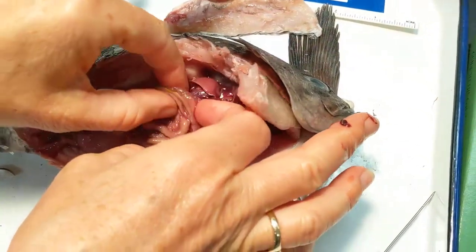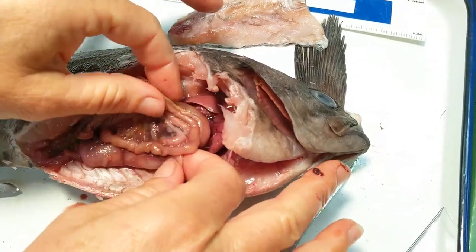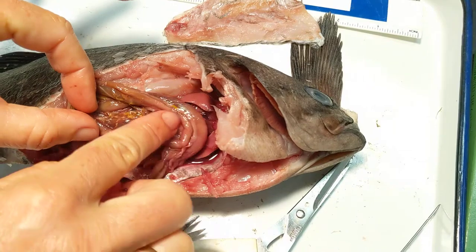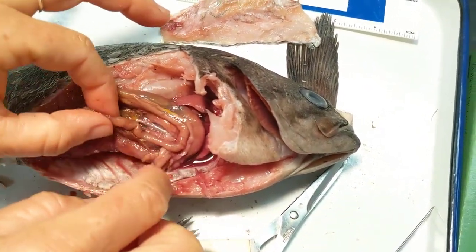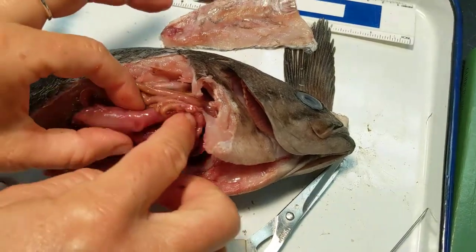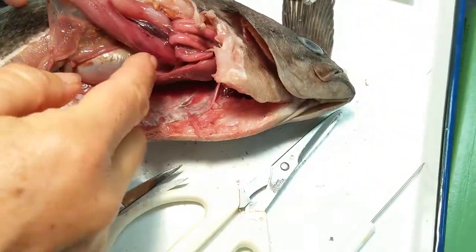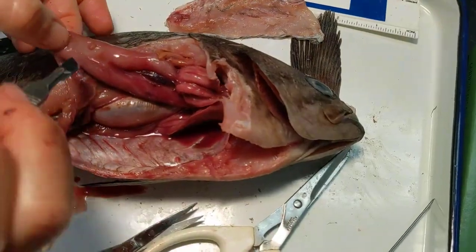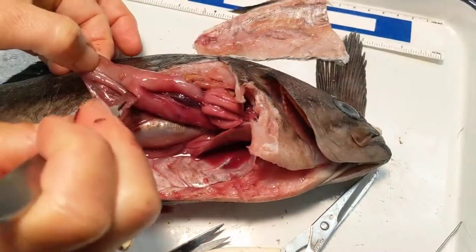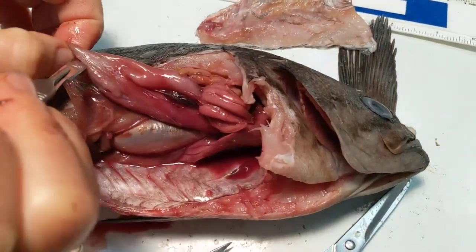We can start to follow along in the intestines. You can see the intestines wrapping around here, the pyloric sacs with some fat reserves on them. And if I flip it up, you can get a good view of this stomach. The stomach comes in here and then up and then it wraps into those. We can just go ahead and slice this open and see if there's anything worth looking at in this stomach.